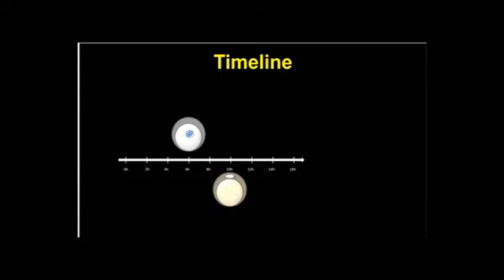4 hours later, at hour 10, another cohort of mouse oocytes will be retrieved as the source of the female genome. These intact oocytes will be activated chemically. 6 hours after the activation, at hour 16, the oocyte extrudes a second polar body, and one with a single female pronucleus will be selected as a recipient.